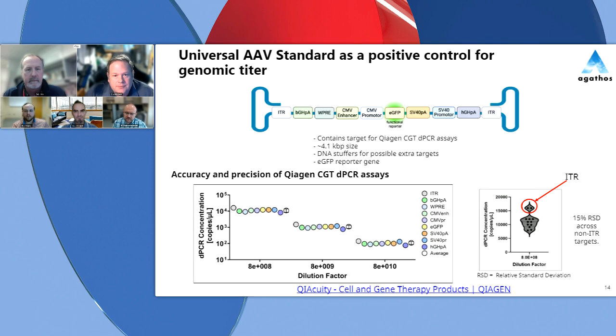One of the reasons behind it is that when Rob mentioned simplicity and robustness in assessing genomic integrity from his GMP perspective, I was also looking for a way to properly handle assay development for AAV quantification.